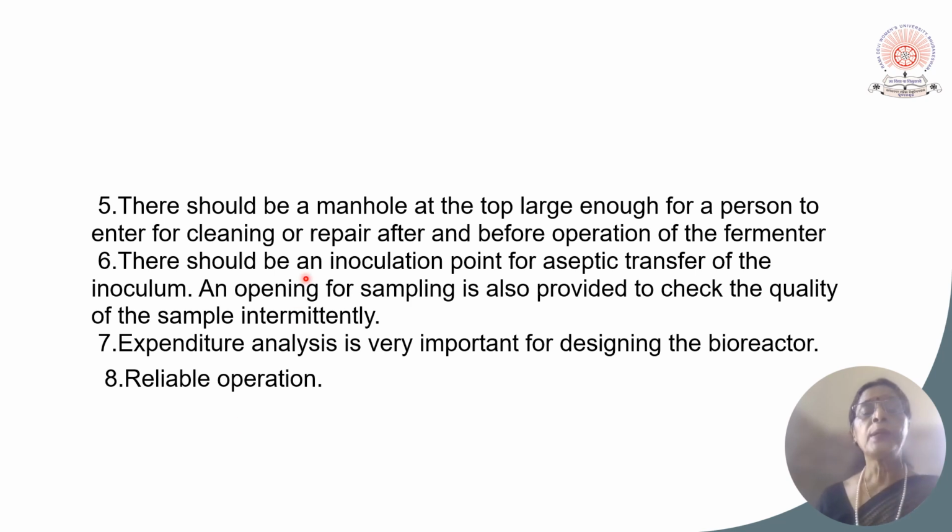There is a manhole at the top through which a man can enter and clean the interior before and after the process, and sterilant can be used properly. There is also an inoculation point for the aseptic transfer of the inoculum. There is a sampling point to take out samples from time to time and check their quality and different other parameters.